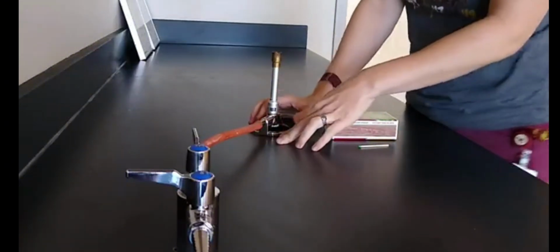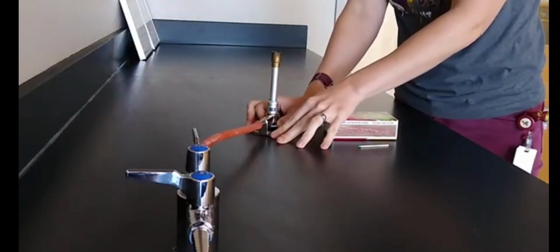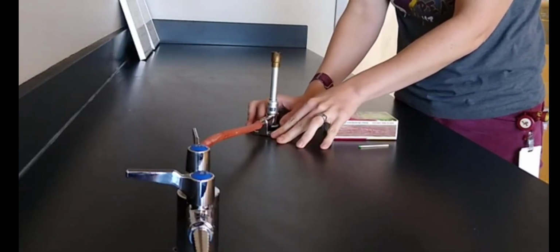Okay, next we're going to open that gas valve until we hear a hiss coming through the Bunsen burner, and that is natural gas coming through, so methane.